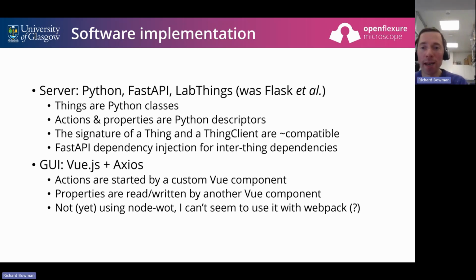And that has been really helpful because it means that we can develop code in a nice, friendly, convenient environment. We can paste it in an IPython notebook, and we can work through our various actions that we want. And then that code pretty much copy pastes directly into a thing which runs on the server rather than in a Python client. And that's really sped up development.